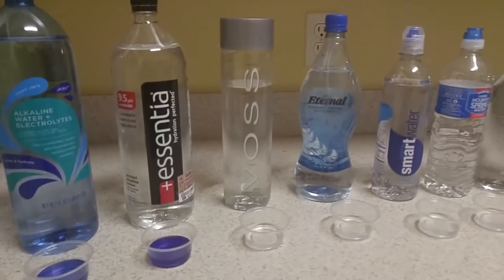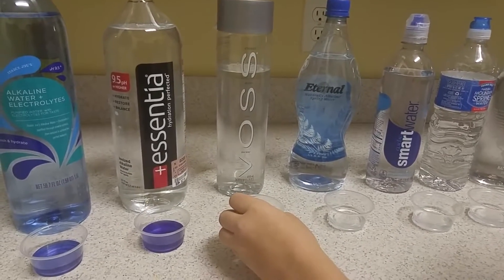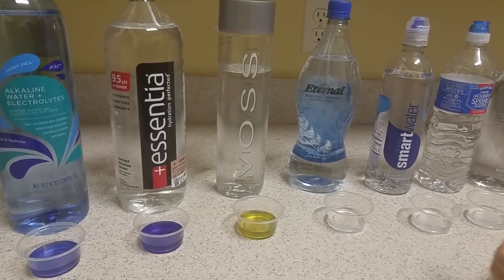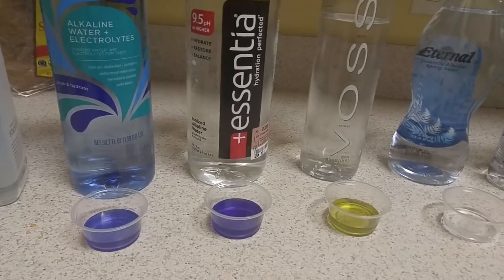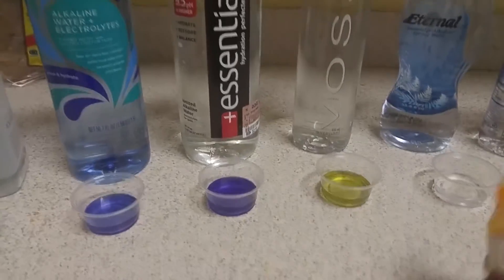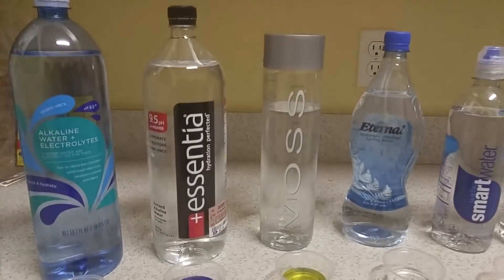Now Voss. Oh, not good. It's around a 5 to 6 — that's not even 6, that's a 5. So that's definitely an acidic water. It's a very expensive water too, so I would not be drinking that one.